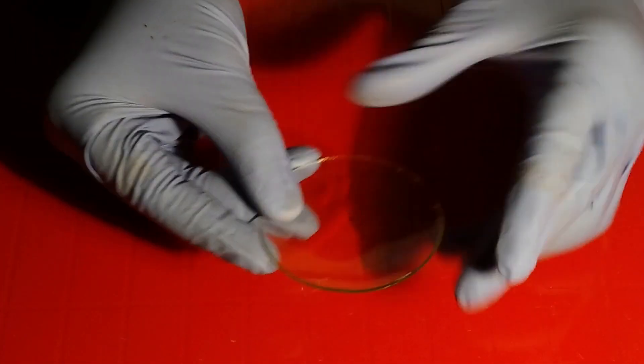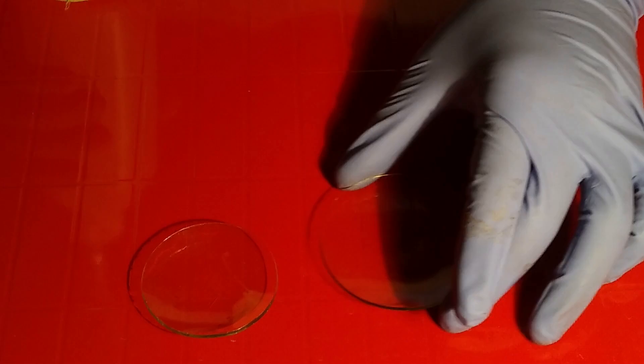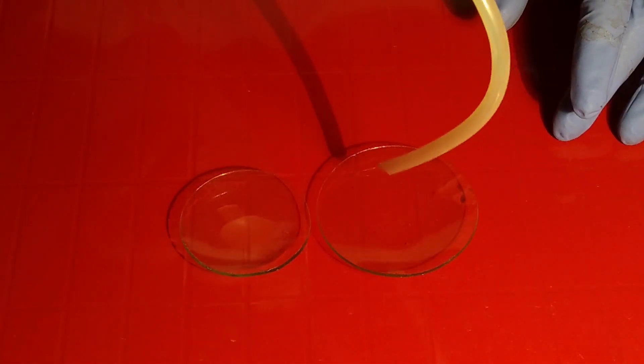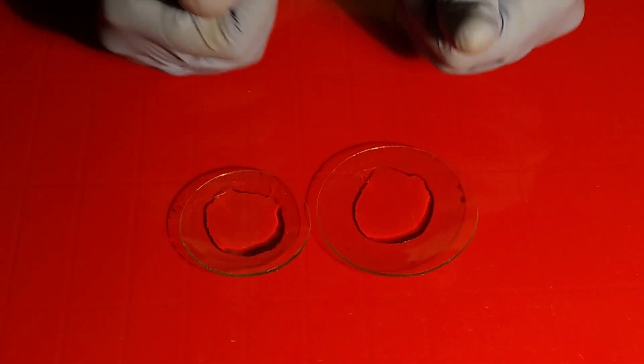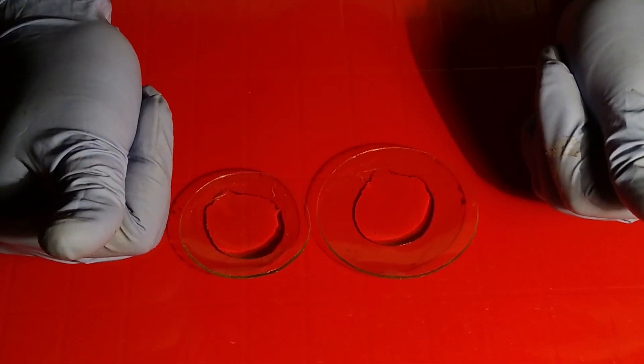Again, revisiting the watch glass section — now putting water in it. If the watch glass is not concave enough, it will not be able to retain water. So you have to be very careful while choosing each of the instruments.